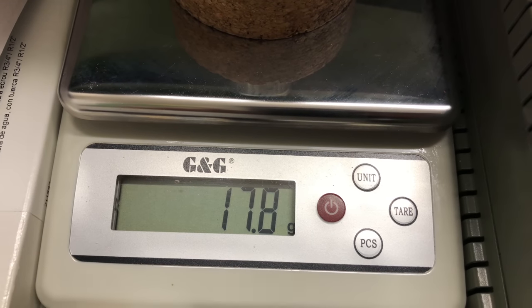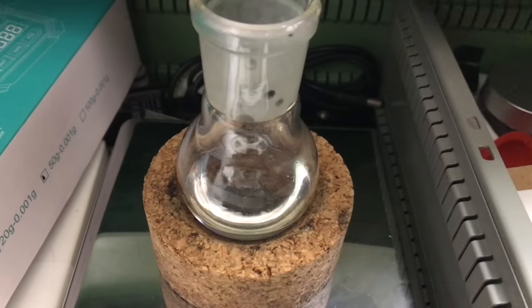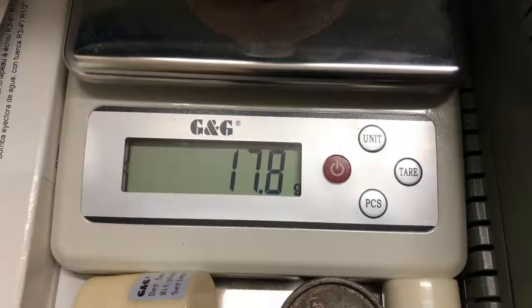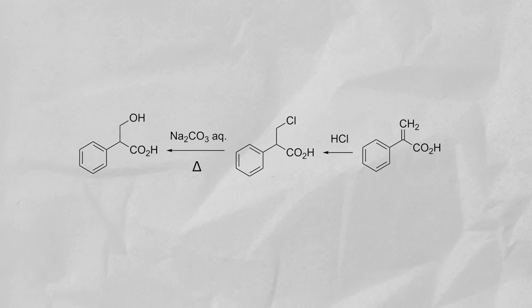After transferring it to another flask, we were left with 17.8 grams of methyl atropate, which corresponds to a yield of about 38.3%.